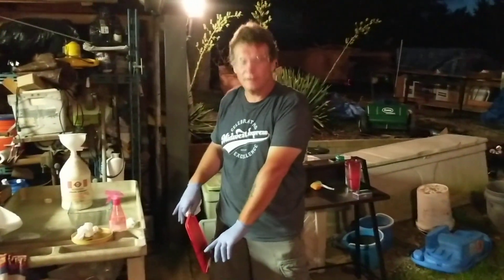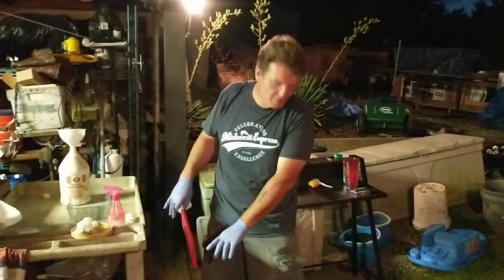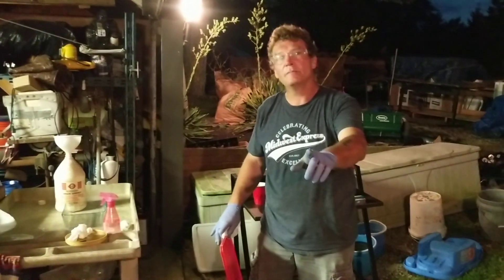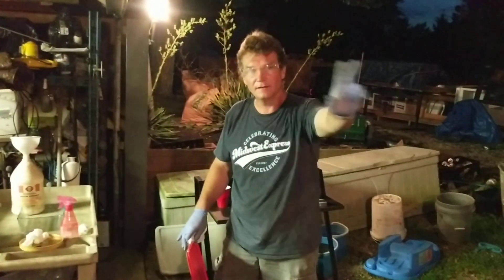I'm going to put a lid on this — not tight, but put a lid on it — then set it back here to settle. You're supposed to let it settle for a minimum of two days, but it's going to settle for a week for me. I'll be back next week to show you the rest. Mike's out of here, take care.